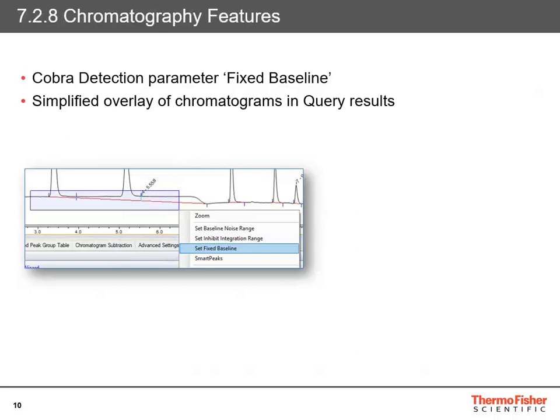There is a simplified overlay of chromatograms in query results. When you run an injection query and get hits from different sequences with different channels, the selection of chromatograms in the studio session has been improved. Previously, the channel selected in the navigation area of the studio was used for all injections in the query — so if you were running with UVVis1 but the query result came from a GC, IC system, or UVVis2, you would get a 'channel is not available' message in the chromatogram plot area. Now, the default channel of the corresponding sequence is used when making chromatogram overlays, making it easy to compare chromatograms from different sequences with different channels.